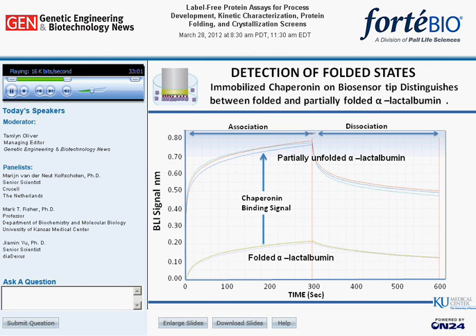Furthermore, the next slide demonstrates that we are able to detect if a proper fold has been obtained by comparing folded with partially folded forms of the protein alpha-lactalbumin. We can detect if a significant population of the protein has acquired a proper fold. As one can easily observe, there is a dramatic signal decline in protein binding to the chaperonin when the protein has adopted its proper fold.